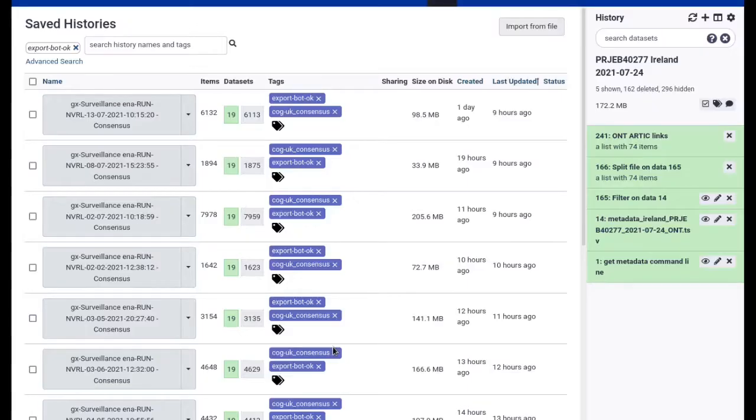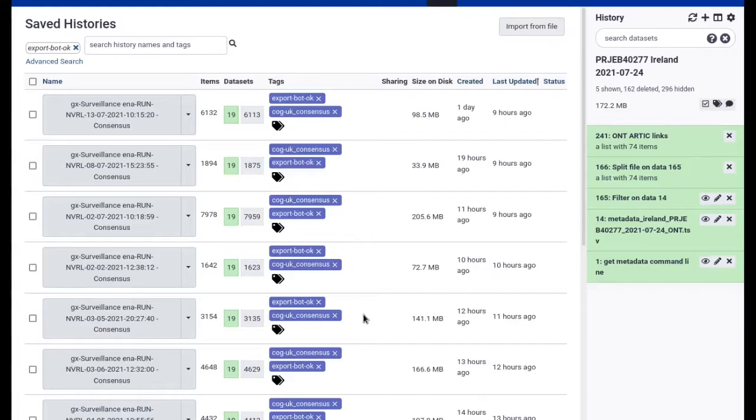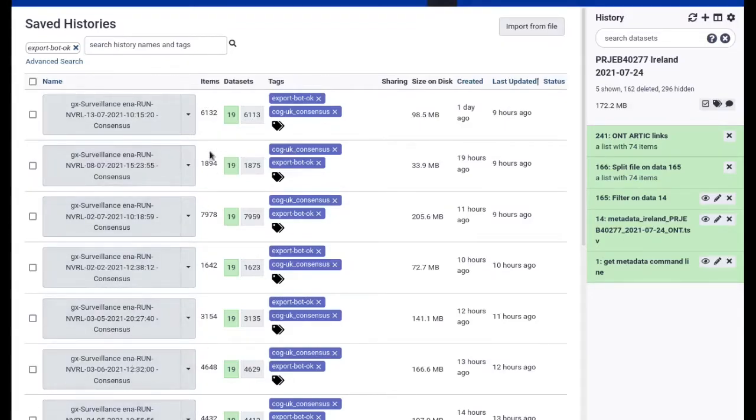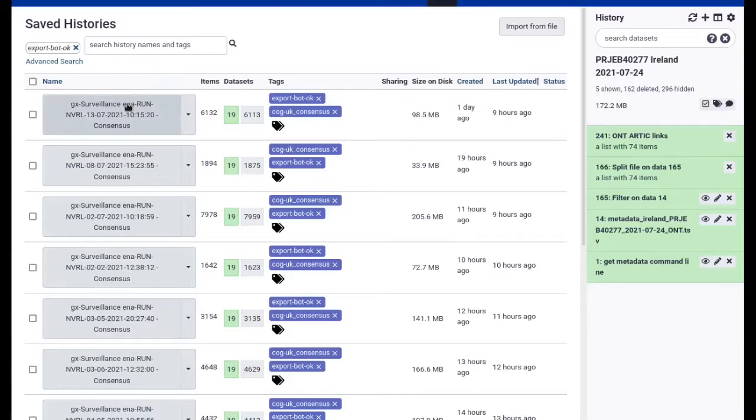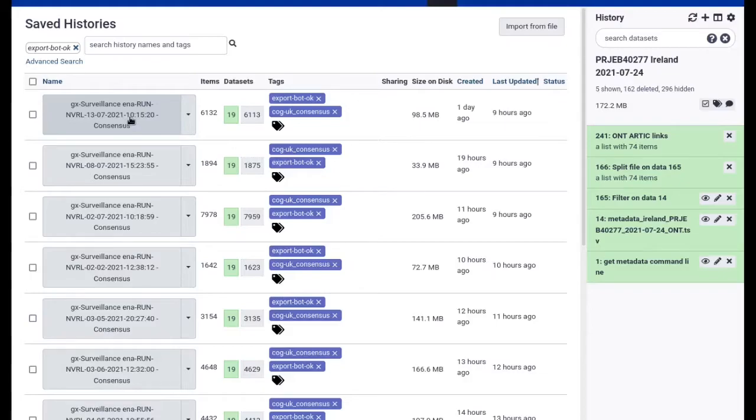Now one particularly powerful feature of this way of exporting data is that it's tool-based and as such can be used in workflows. So going back to that other example with the many consensus histories produced in the SARS-CoV-2 bot account on usegalaxy.eu, we solved that issue of getting access to all key results files with an additional export workflow. That workflow gets launched again through our bot script whenever a consensus workflow run finishes.